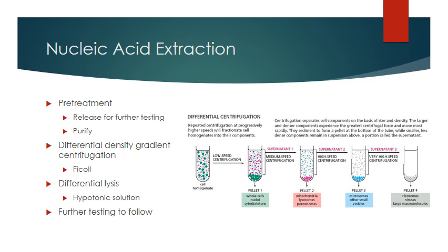And the purpose is to release that nucleic acid so that we can use it for the next step, whatever it's going to be. We want to release it so that we can get the nucleic acid completely uncontaminated. We want to remove it from all the other proteins, carbs, and lipids, and even the other nucleic acids that we're not interested in. We really want either pure RNA or pure DNA in our test tube so that that's what we can test. Why should we have to weed through all of the hay? Why can't we just separate out all the needles that are in there?